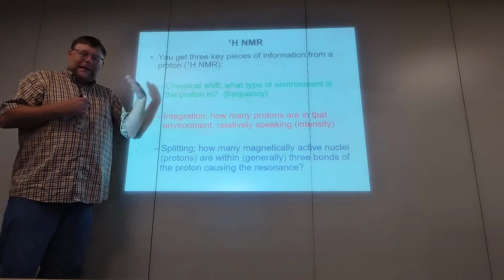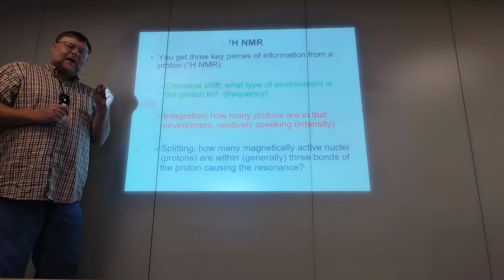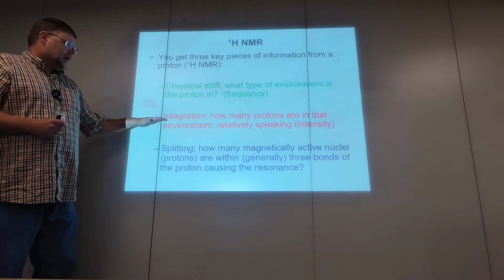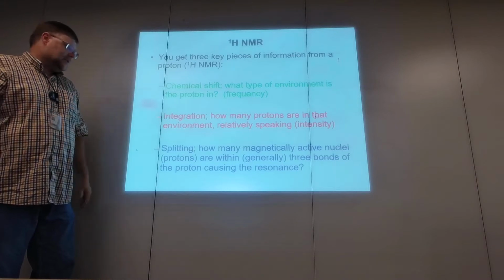You have to look at integration. That's how intense the signal is. The peak area in proton NMR is proportional to the number of protons making the signal, so integration is going to tell you how many protons you have making that one signal.